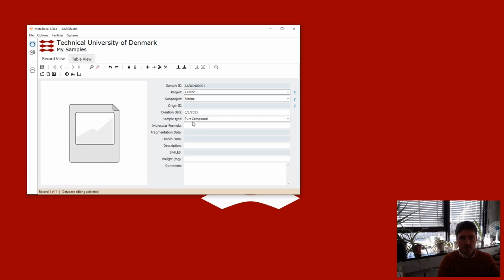As you're going through these different sample types, you'll see that some of them have special data types that can be associated with them. Well plate is another one, so we can specify which wells on the well plate have our samples and what those samples are as well.